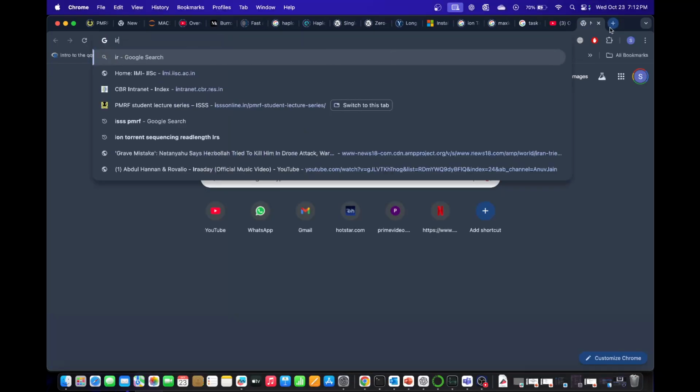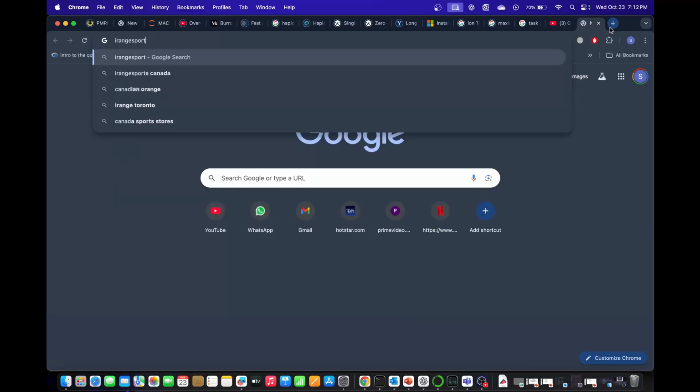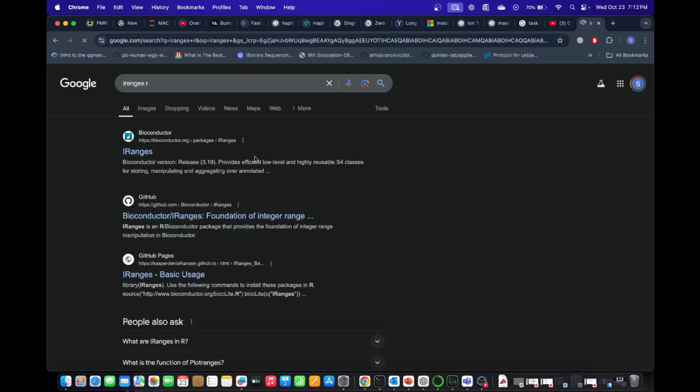I do not particularly use, we use, say, Python and R, but that is for downstream data analysis, maybe after alignment, after we've called the variants. Now, if you want to see particular things about the variants, or if you want to do particular analysis, then we use R and Python. We generally do not use R and Python in these steps.